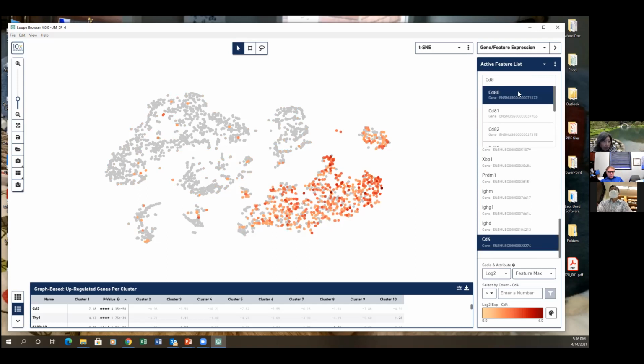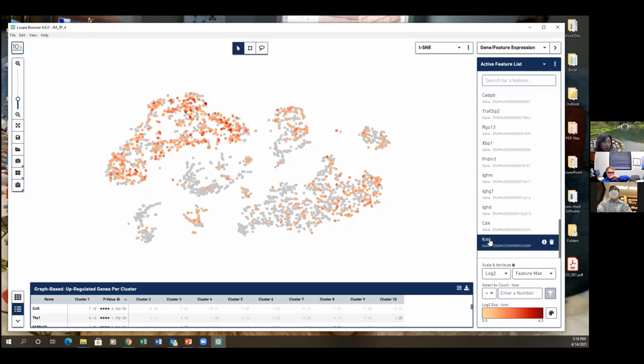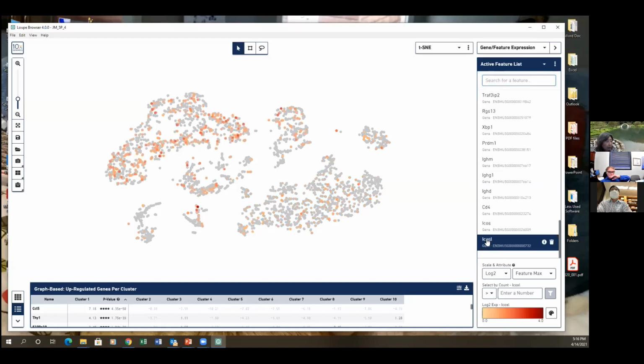Right, these are TFH. Can you do BCL6? That should be all over. Yeah, it's over, because it's in the B cell and the T cell zone. That's BCL6. Not too many, some in the T cells. So ICOS. Right, see, they're all positive. ICOS ligand is on the B cell, I think. That's right.